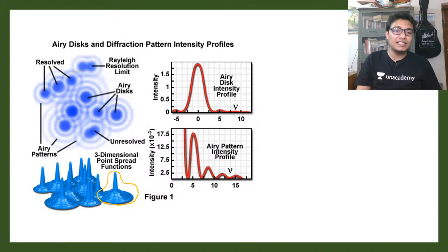Imagine this might be the localization of some protein. This is your microscope image. Whatever you see as an image in the microscope is, at a bare minimum, nothing but diffraction patterns. You must be amused to know that.